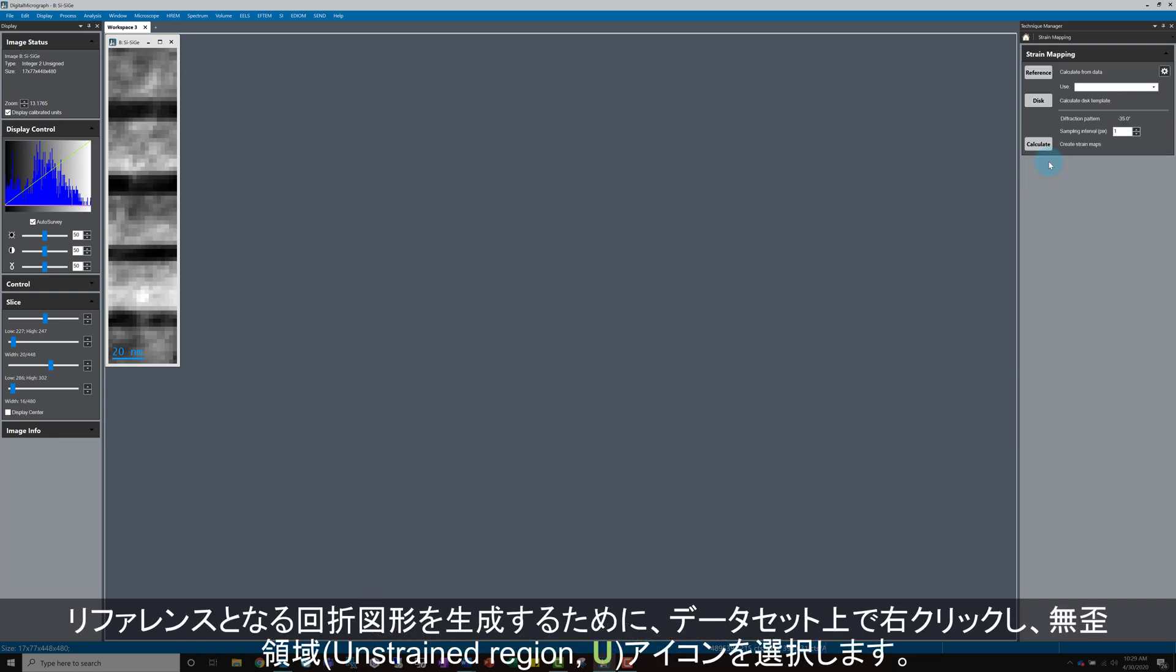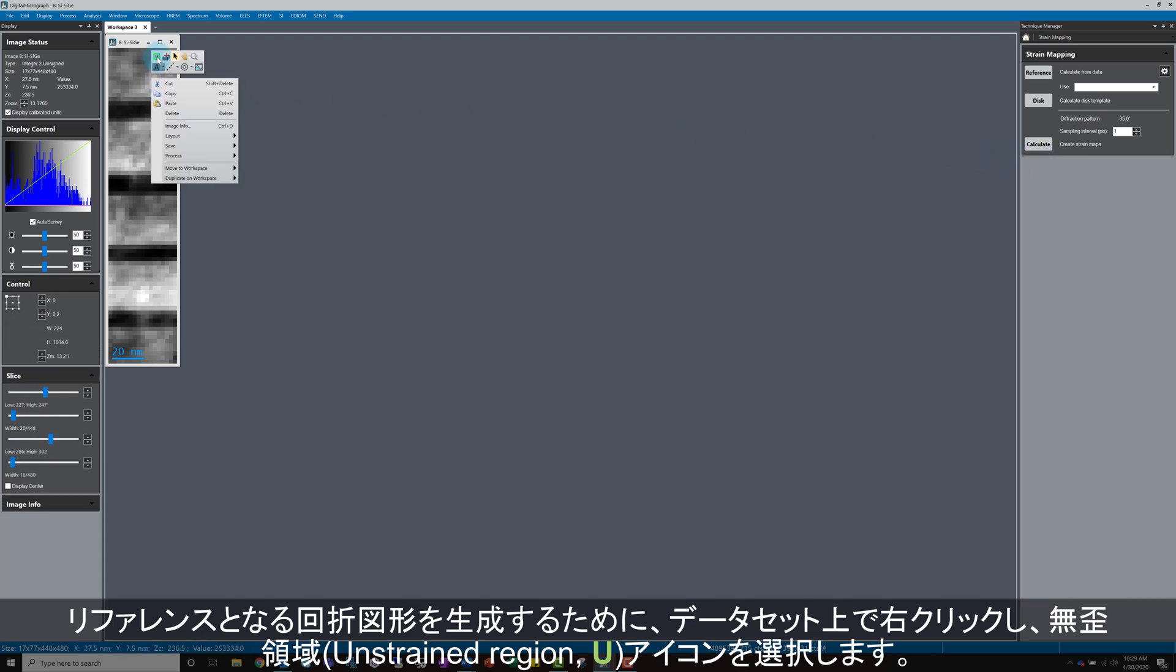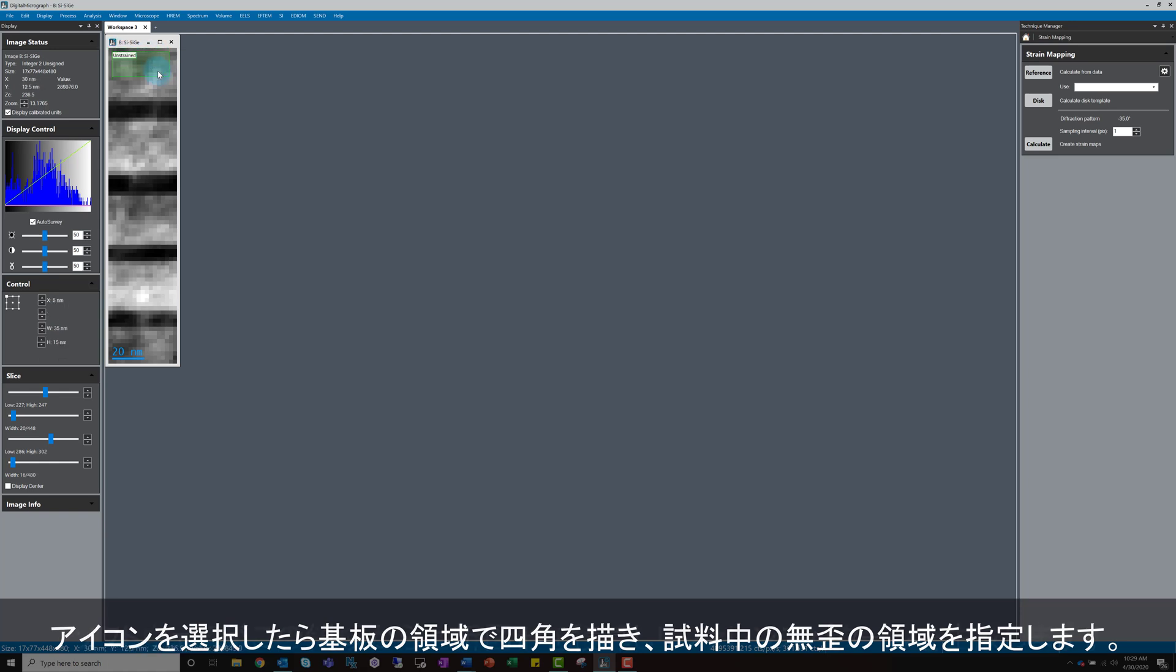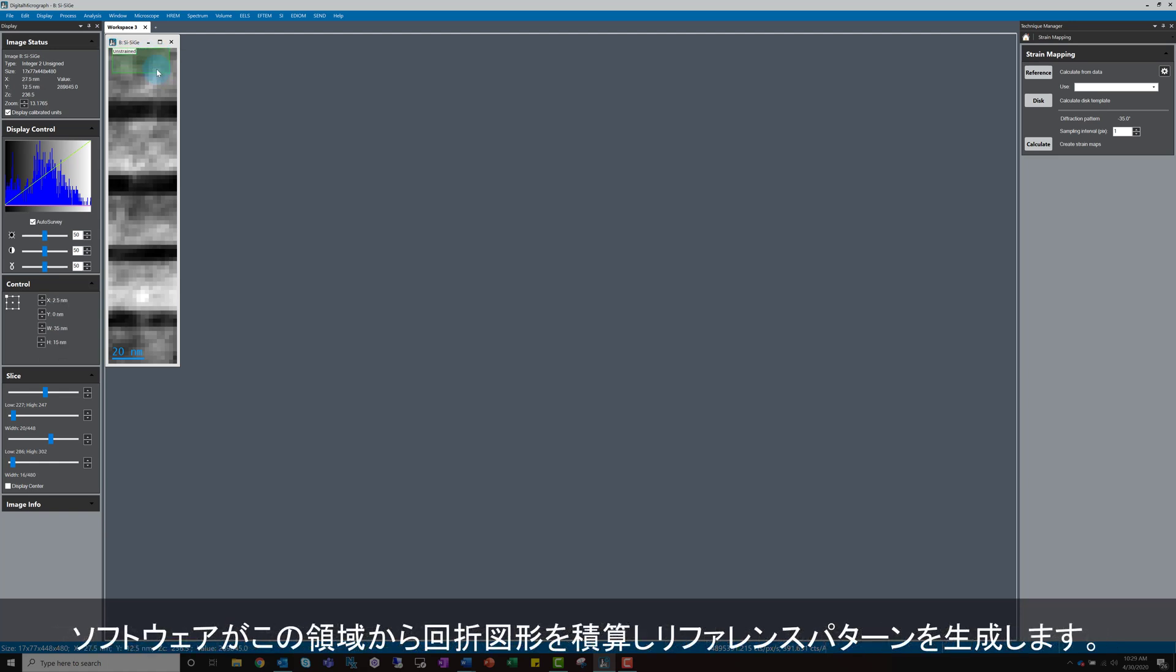First, we need a reference pattern for the strain measurement. If I right-click on the dataset to the left of the Picker tool, there is another tool with a green U icon. This tool can be used to specify the unstrained region in the sample. Select the tool and draw a box in the substrate region. The software will sum the diffraction patterns from this region to generate the reference.